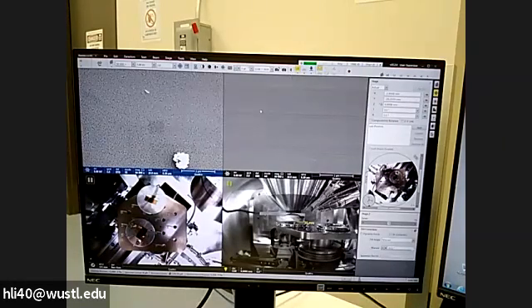If you need to freeze both images, you use Shift and pause. Okay. So now if I like only the left image, I just highlight the left image and click pause. And you will have a button there blinking. And you can see the scanning line. So after you finish scanning, we will go to record. If you like the second image, just highlight and pause. Or you can use the Shift key and pause both images.